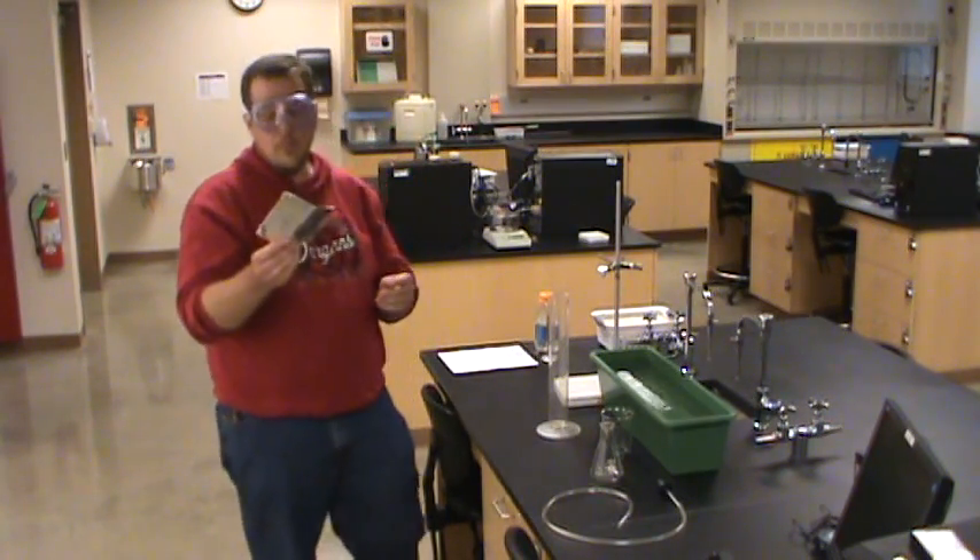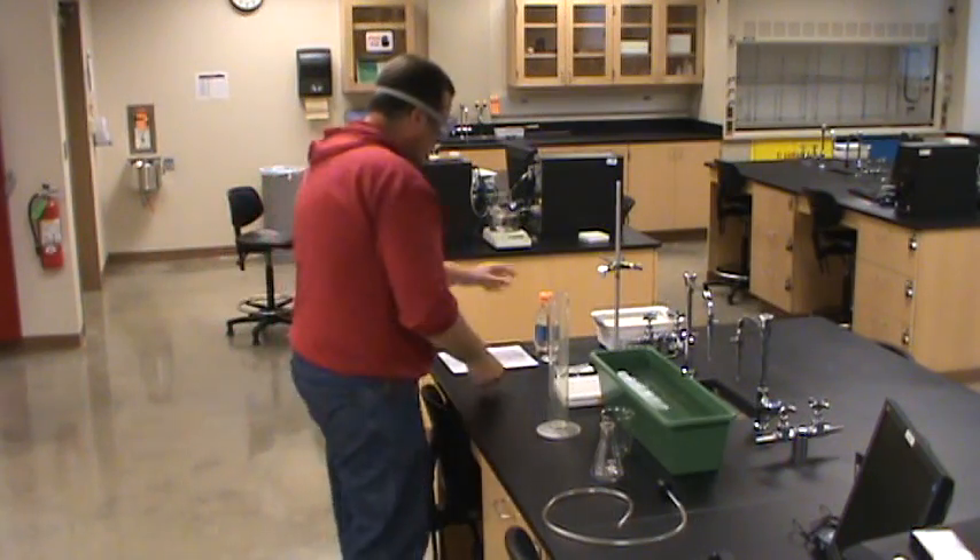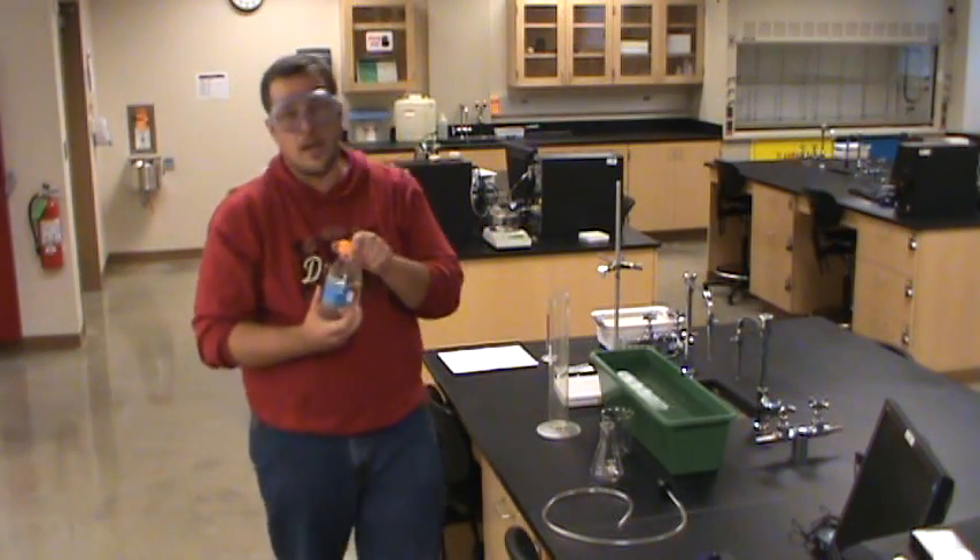Our reagents: we're going to be using aluminum, and it turns out that the aluminum foil you can buy in the grocery store is actually a pretty good, pretty pure source of aluminum. So that's what we can use for this experiment. And hydrochloric acid.